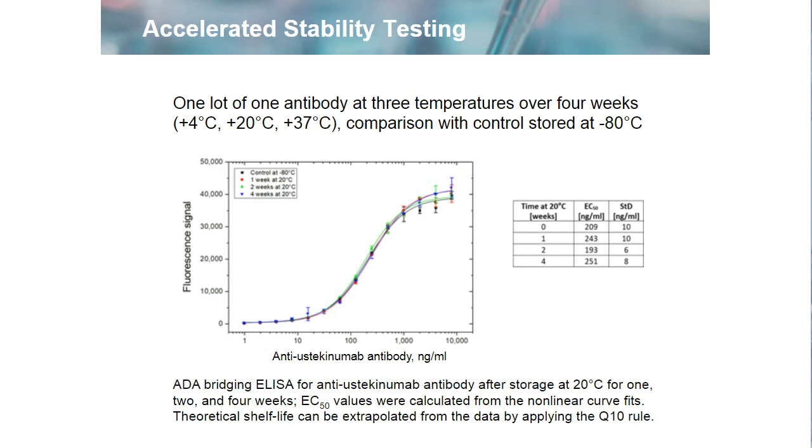One mainstream method of assessing stability is to look at accelerated stability. So obviously you don't want to wait 2 years before you start using your antibody to see if it has 2 years real-time stability. What you'd want to do is use an accelerated stability study to give you confidence and then run your real-time stability in parallel with other studies.